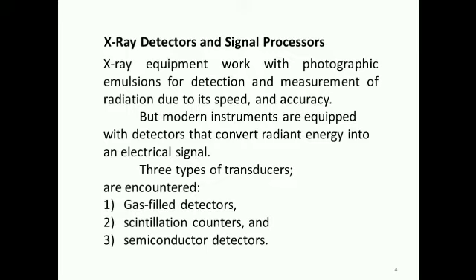So, there are three types of transducers, that is detectors, present. First, gas filled detector, second, scintillation counters, and third, semiconductor detectors.